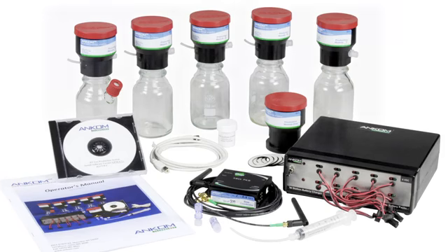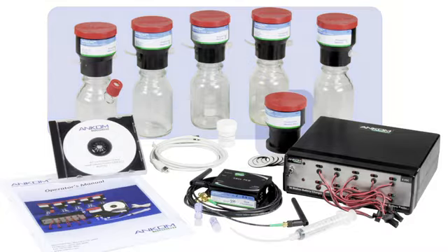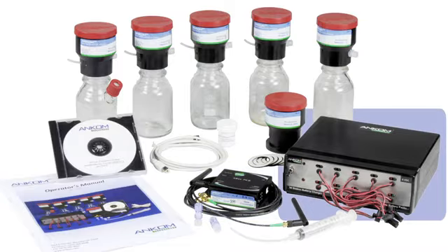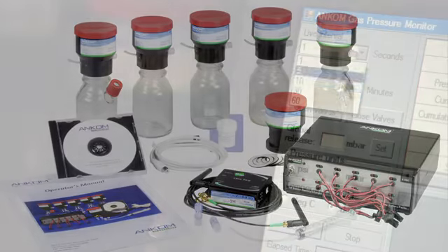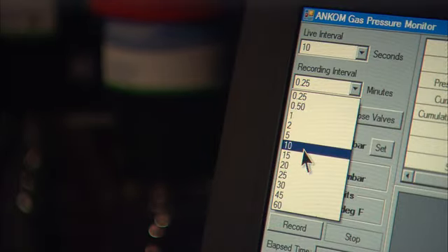The RFS base kit includes 5 RF1 modules with rechargeable battery packs and standard 250 milliliter bottles. However, you can modify the kit with different bottle sizes and types. The kit also includes a module that measures atmospheric pressure, a radio frequency transceiver, a 10-station battery charger, an antenna extension cable, extra luer caps and valves, synthetic grease to aid in creating an impervious seal between the bottle and the module, and user-friendly computer software that controls the system and captures data.